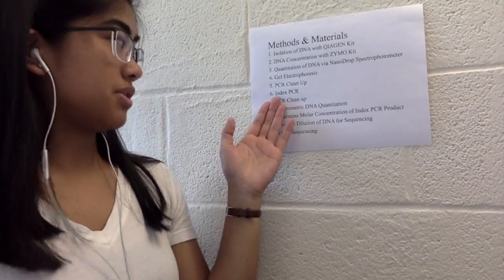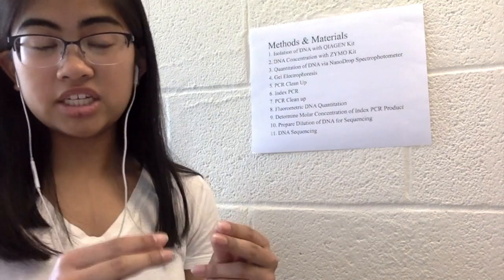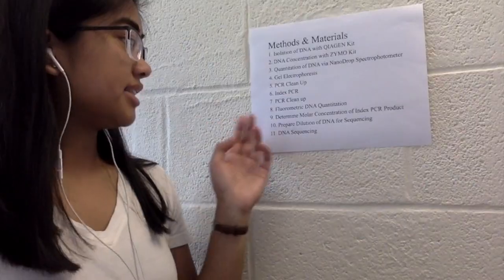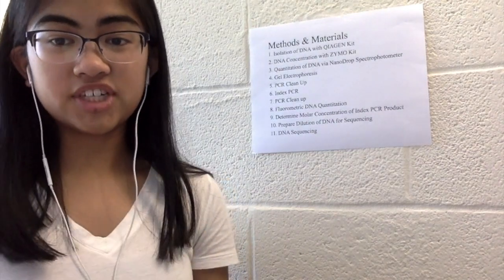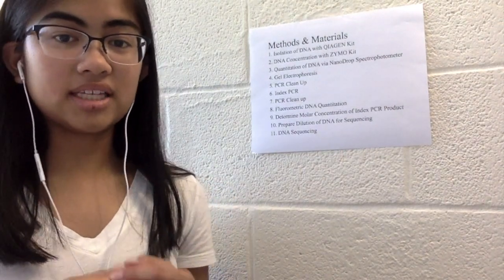Next is step 6, which is the index PCR, which helps to determine the nucleotide sequence by adding a unique sequence tag to each sample's DNA. Step 7 is a second PCR cleanup where we get rid of all the impurities. Step 8 is the fluorometric DNA quantification, which helps determine the concentration of the amplified sample, which is more accurate than the UV because it's more sensitive in distinguishing between the RNA and the DNA.